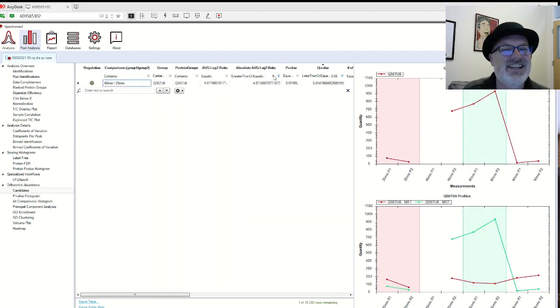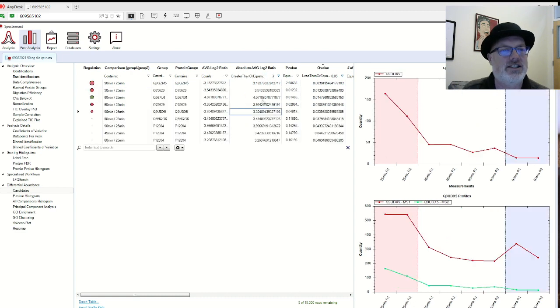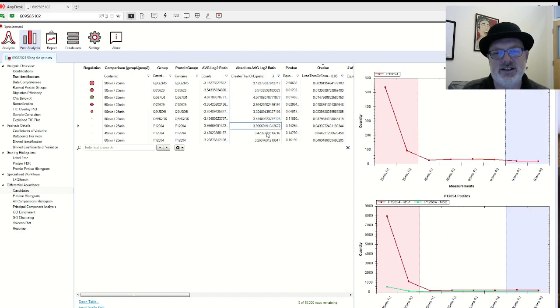Whoa. So remember, that's like a fold change of like 16, right? So let's see, we do like 3. You're looking for the things that are really different. Look at that, that's interesting. And the size of this, what does the size mean? Size must mean something. So it defaults, just remember there are default filters here.